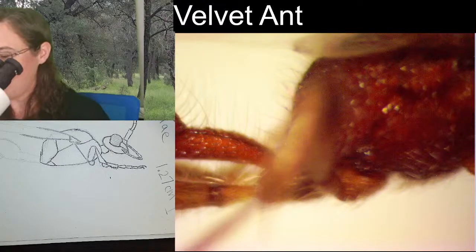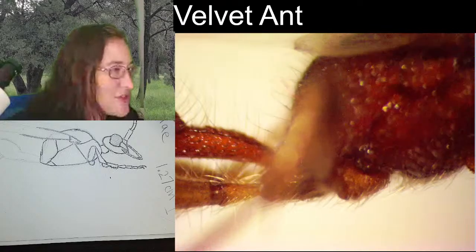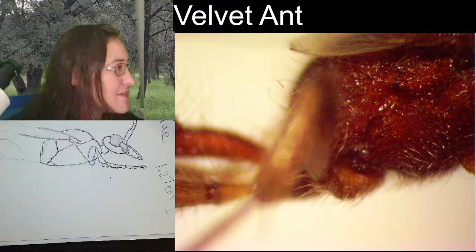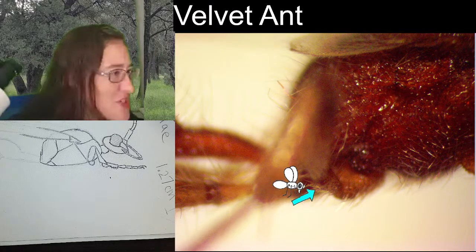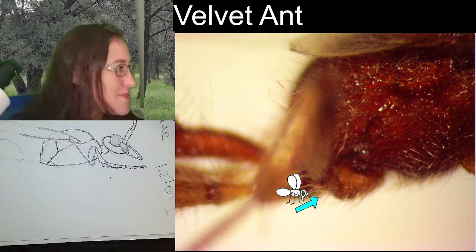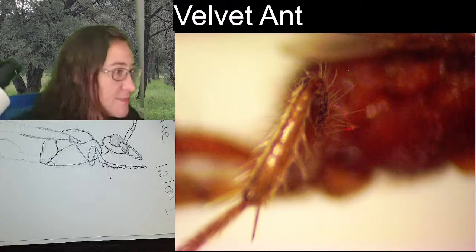Oh, hey. So we regularly aren't able to see the trochanter, but if we look at this side, you can. So this is the coxa right here, and this itty-bitty little triangle that starts the femur up in this direction, that's the trochanter. Essentially, it's the segment between the hip and the femur that works as a knee. It helps it bend in a direction. Then we've got the femur coming up towards us.